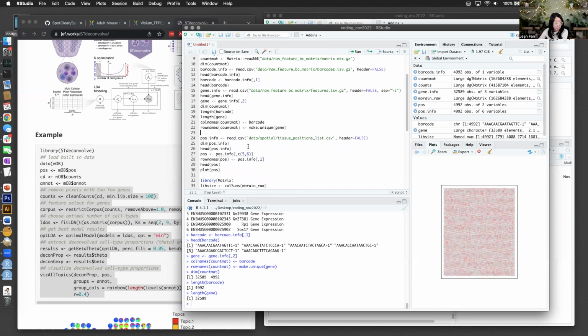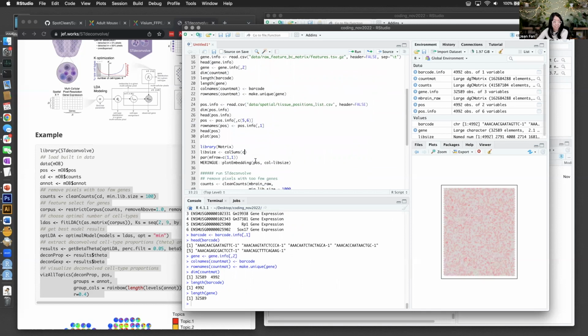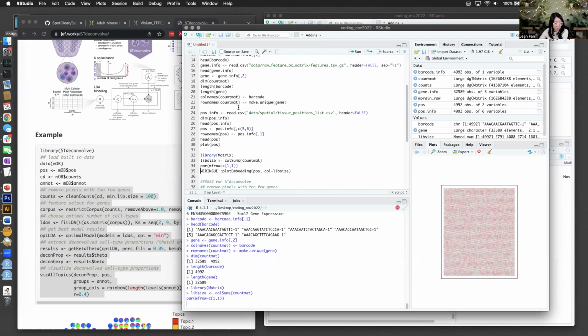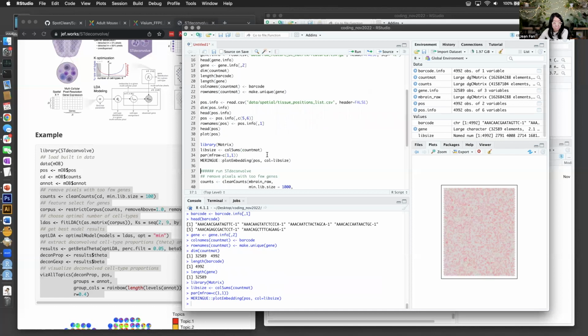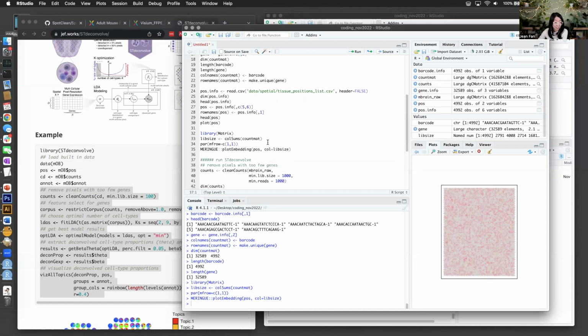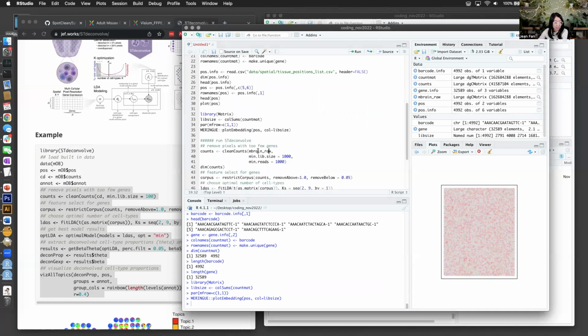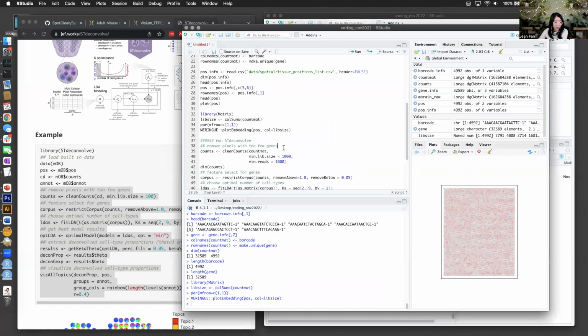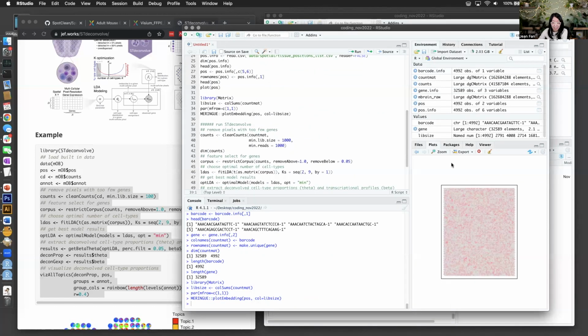Okay, so now I have a count matrix. Now let's see, is this any different? I could just try to say equals equals to the raw matrix, but I feel like large matrices don't like that. Okay, well, it looks the same, so I guess it is working as expected. I'm still going to update everything to the new count matrix. Did this finish? Oh my God, it's a second iteration. Okay. Well, fine. We'll just continue with the STdeconvolve analysis on this kind of funky data set.